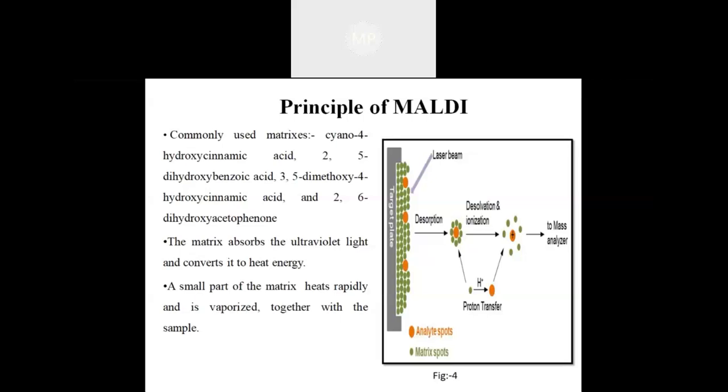An organic substance containing an absorbent solution, which is termed the matrix, is mixed or coated with the material which is going to be examined, and when exposed to the laser light, the matrix acts as an energy absorber.